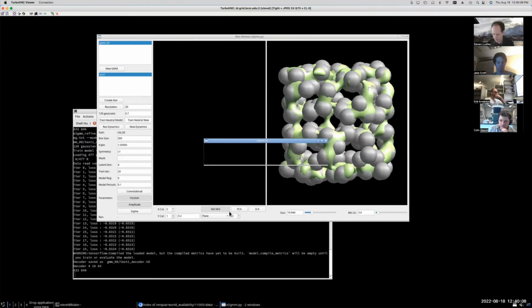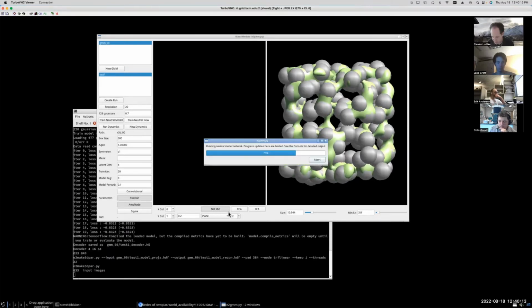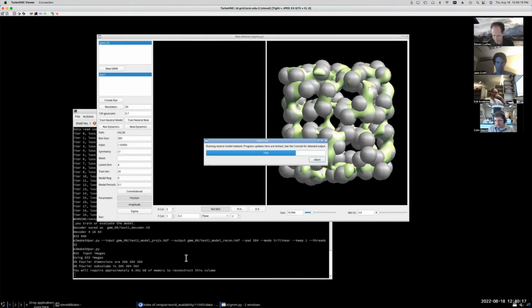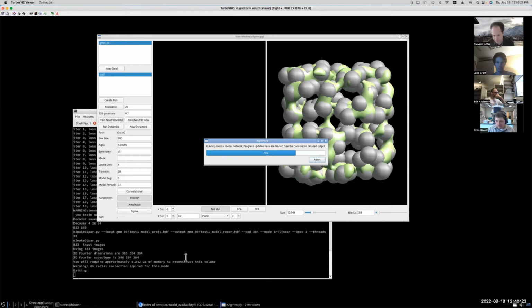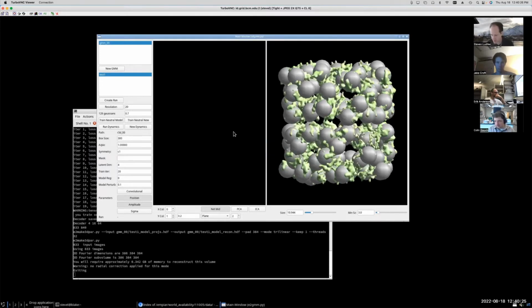Okay, so that's finished. Almost finished. Okay, sorry, it has to do one last make 3D. Okay, now it's finished.